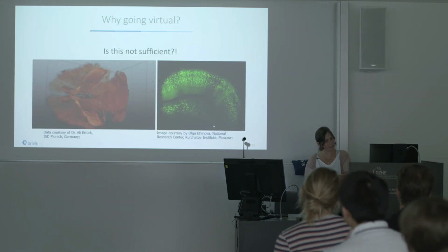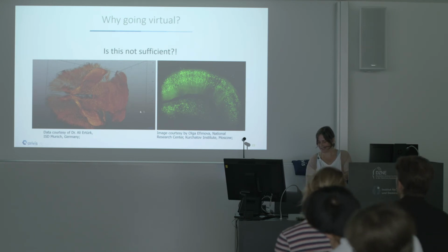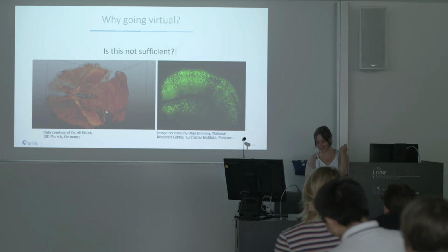It's now the third year of development. And here we see a nice movie. And we thought about having you here as a model for our demo. So we have this data set. You saw it before, but the color mapping was green, in Ali's talk. So this is a nice screenshot of the brain data set, and Mike obviously can give details of the biology behind it.